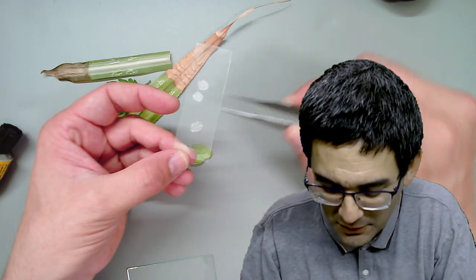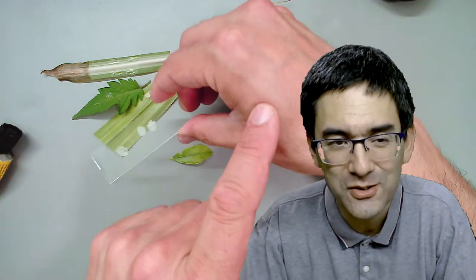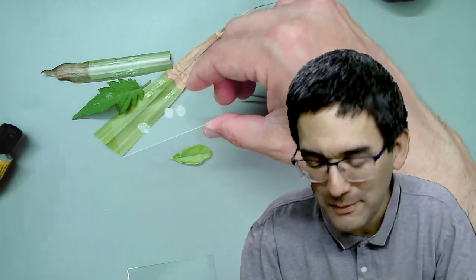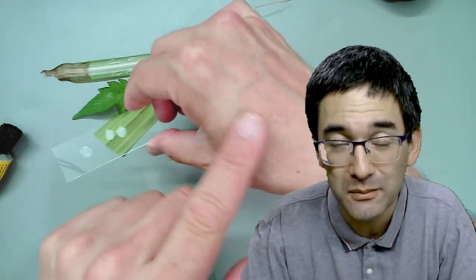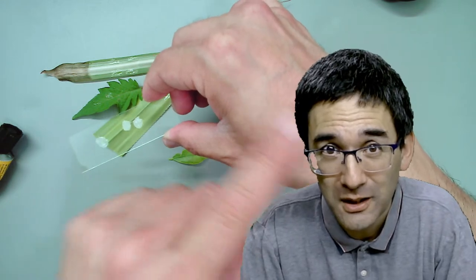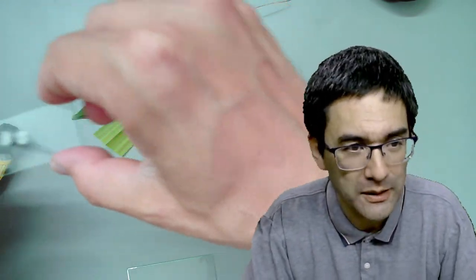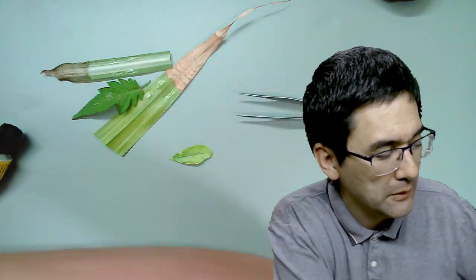I've also tried to take impressions of my own skin, but this was a little bit difficult because the skin is not smooth. Maybe by putting a little bit of fatty cream on before applying the glue that might help - I haven't tried this yet. So let's have a look at the top surface of the lemon tree under the microscope.